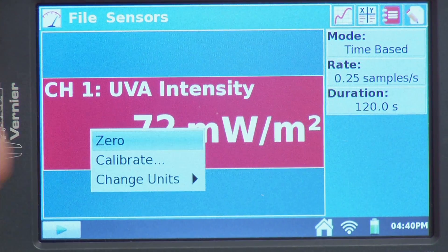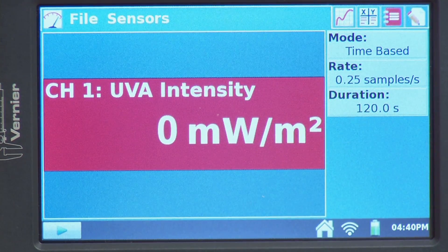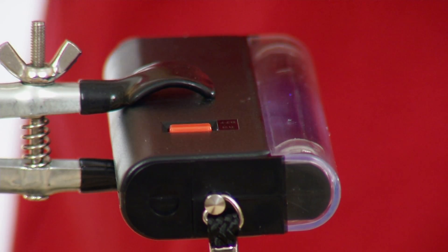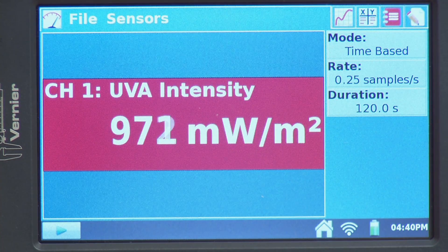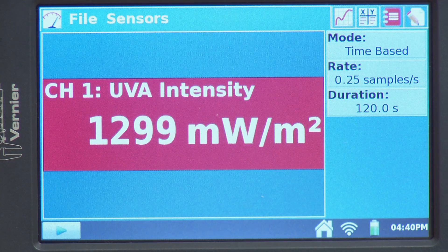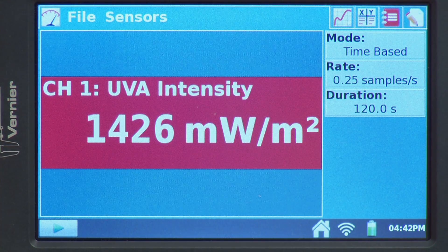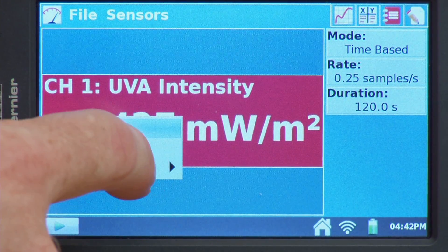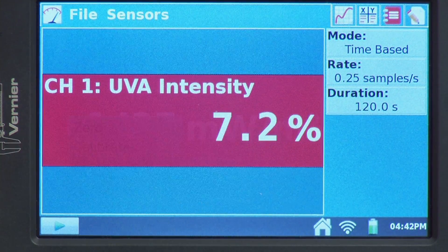There are a couple of things I could do here — I could zero the sensor at this point. Now when I turn the UV source on, we see that as the light comes on, we're getting an increase in UV radiation, and as the light warms up it continues to increase. For this lab, I'd like to measure relative intensity as a percent rather than milliwatts per meter squared, so I need to change the units.